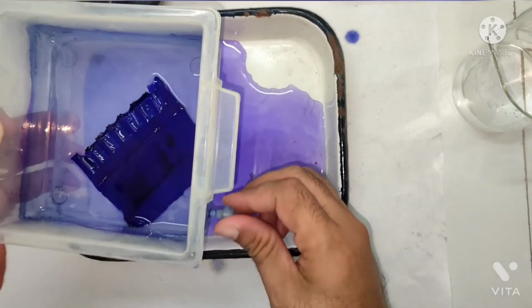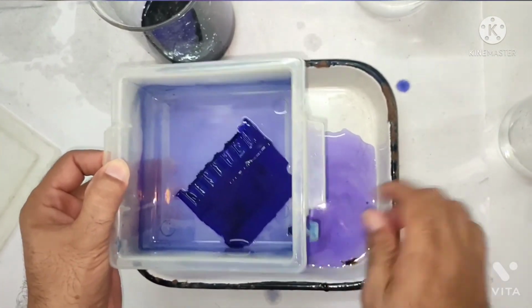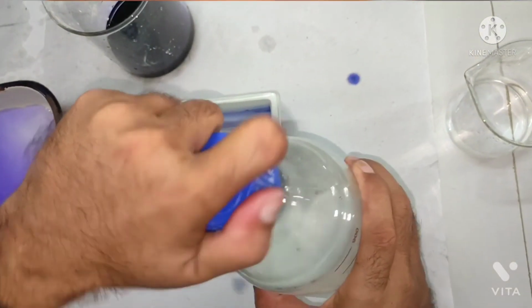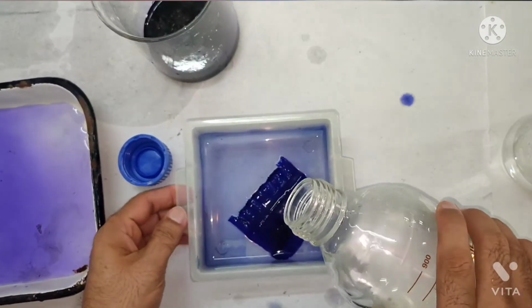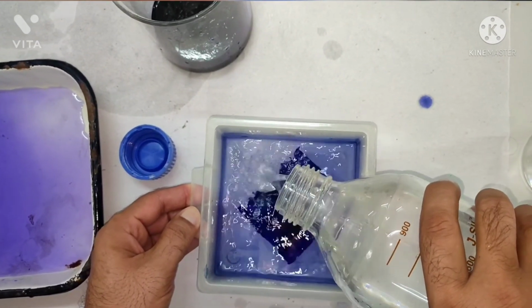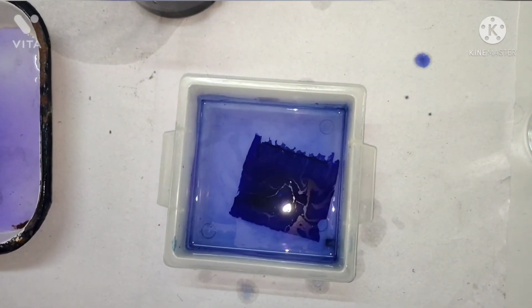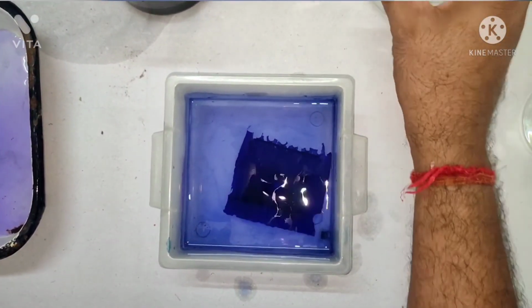So I'm just tightening this notch, and I'm putting the destaining solution here, right? So this is our destaining solution. We made the destaining solution, which is nothing but acetic acid, methanol and water in the given proportion. Okay, so now you incubate it again, put it on the rocker for 1 or 2 hours. Then after that you change the destaining solution again.